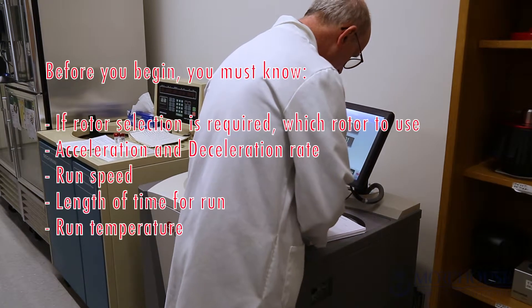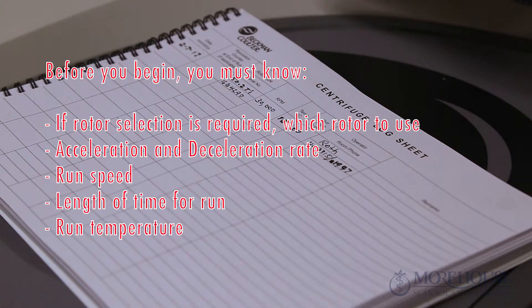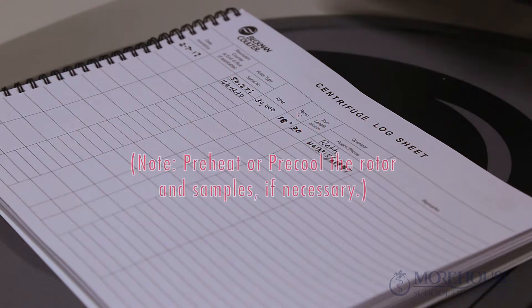Before you begin, you must know if rotor selection is required, which rotor you're using for the run, acceleration and deceleration rate, run speed, length of time for the run, run temperature, and whether you need to preheat or pre-cool the rotor and samples.